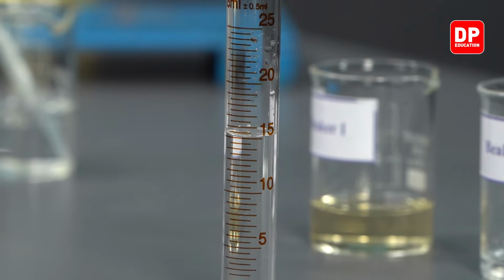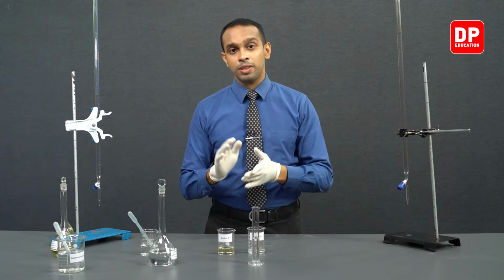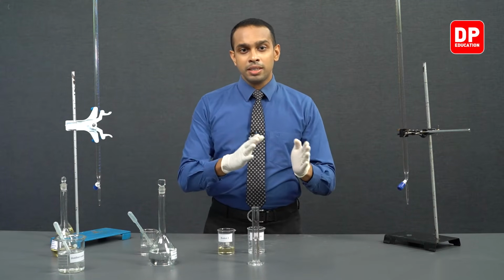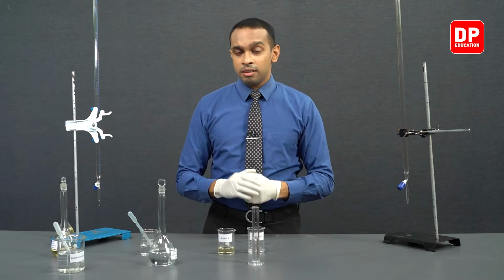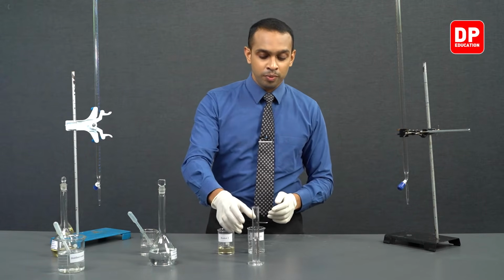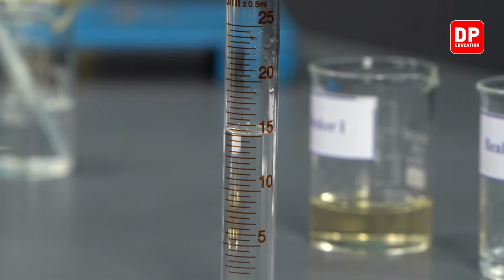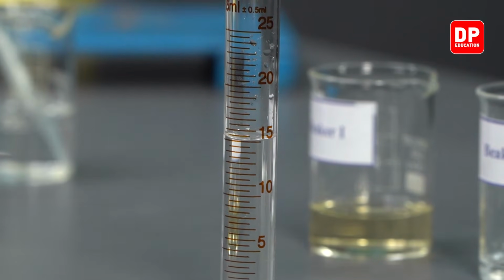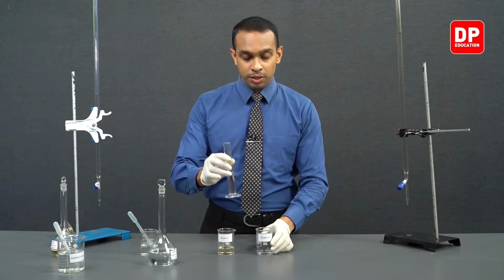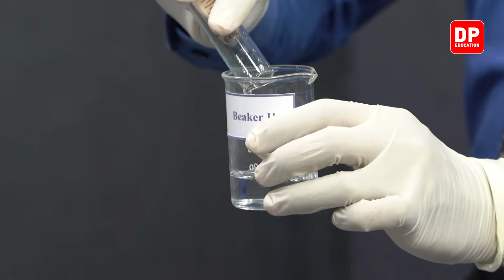And keep in mind, thiosulfate ions do not interfere with the reaction between I- and Fe3+. So thiosulfate ion being present in the medium will not change the main reaction that is happening in this experiment. Now let's transfer this 15 cubic centimeters of sodium thiosulfate into our beaker 2.